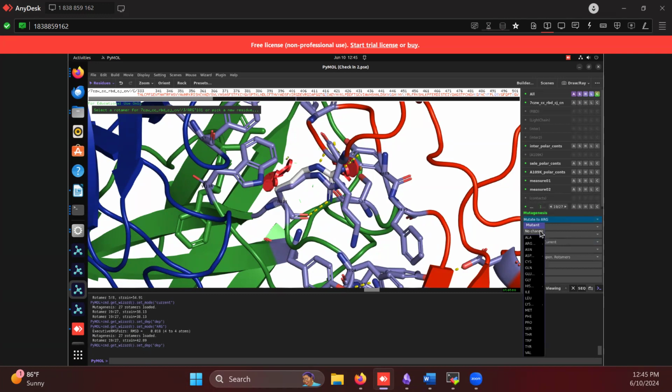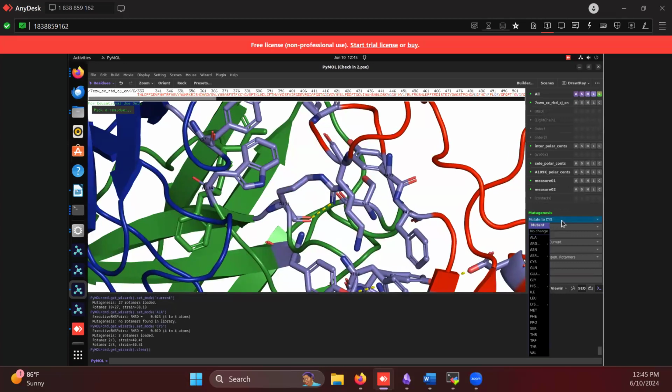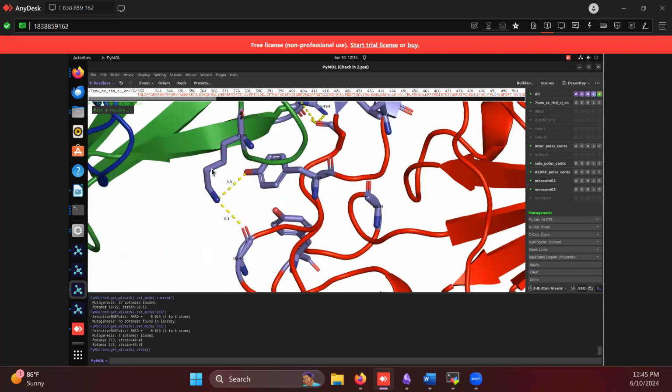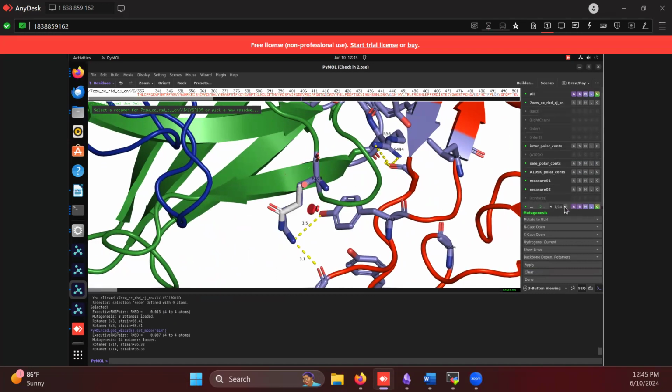Maybe it's that this specific residue only has one rotamer possible. I think when you change it to histidine, there were more options, but I don't know if it's residue specific. Okay, it moved up. Oh yeah. So let's go to no change. If you go to no mutations and click this, it will show all the different rotamers here. And you can select which rotamer you want. But yeah, that is also there.